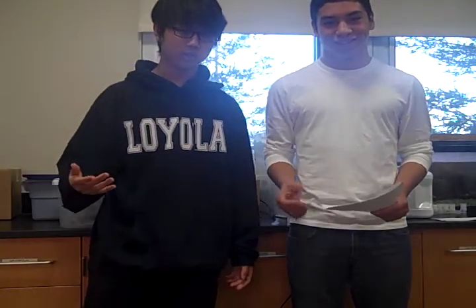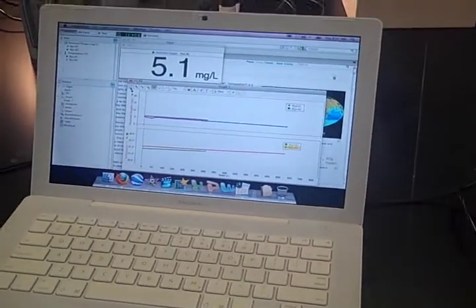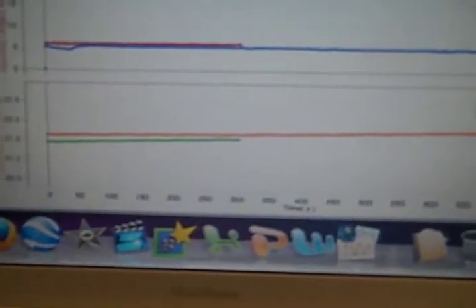Hi, I'm Edwin. I'm Will. And we're doing the photosynthesis lab for Loyola APES. For our experiment, we're using the Data Studio on the Mac. We're predicting that the temperature is going slightly up, and the dissolved oxygen is below what it was before the plants were inside.